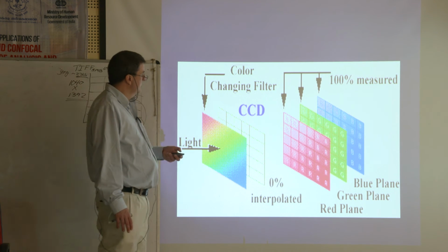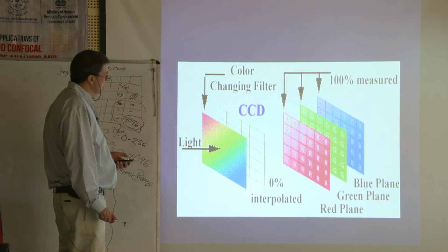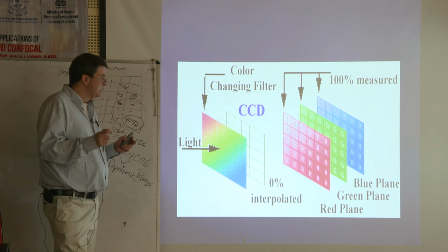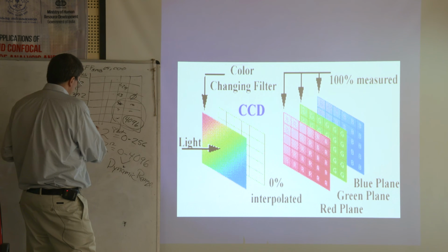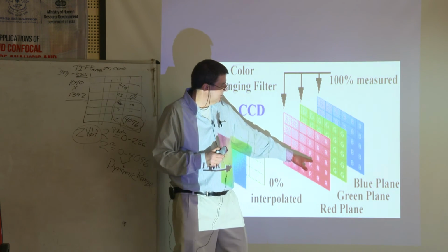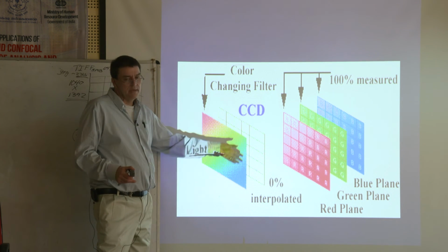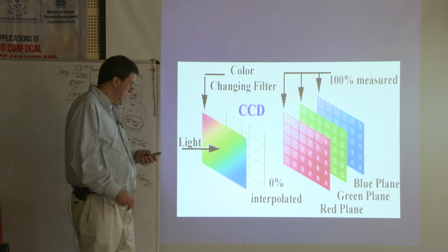Okay. So remember, it's just a red, a green, and a blue. Now, when I usually talk about color, I'll call it true color, or I'll call it 24-bit color. The reason I call it 24-bit color is if you look at each of these channels, you're actually taking an 8-bit red, an 8-bit green, and an 8-bit blue. So 8 plus 8 plus 8 is 24, right? So a true color image is actually a red, green, and blue. It's an 8-bit, an 8-bit, and an 8-bit stuck on top of each other, okay?